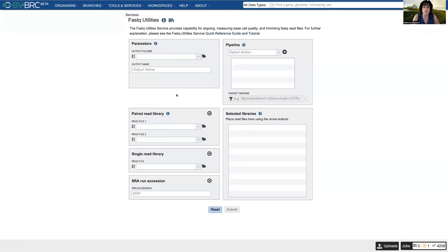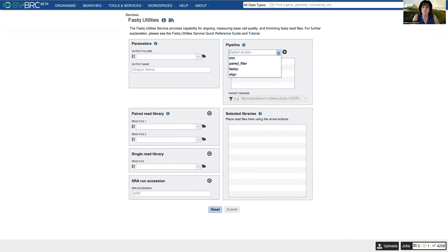When you open that up, you see there's a parameters box, a pipeline box, and a place for the reads. Under the pipeline box, it gives you a number of options.